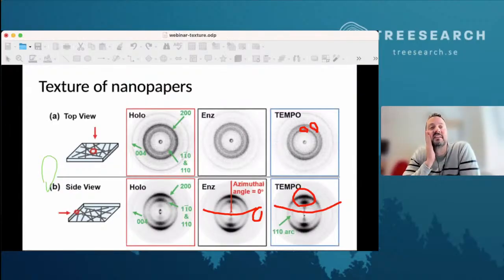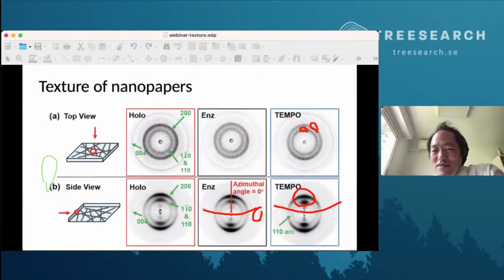Per, do you have any? First I felt that your presentation was leaning towards we don't really need synchrotrons and all those things, but in the end you finally came there. When you have the best possible beams and everything, you showed the slide where you could estimate the moisture content. Is that a relative moisture content, or would you dare to say more?